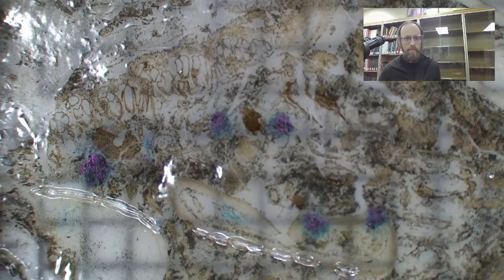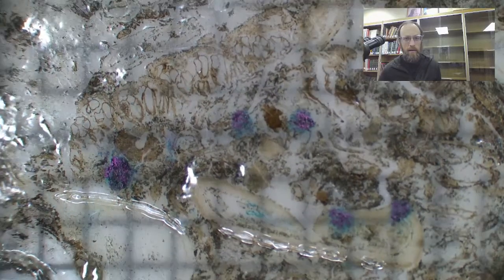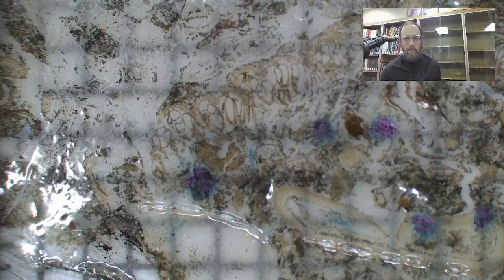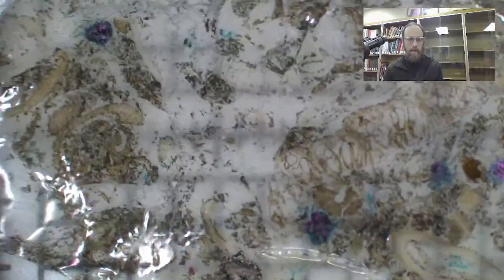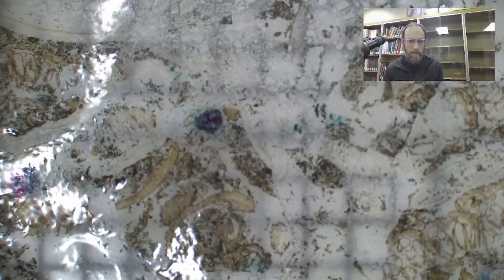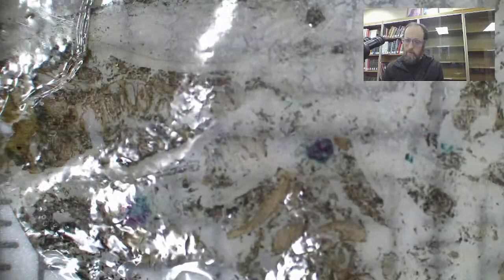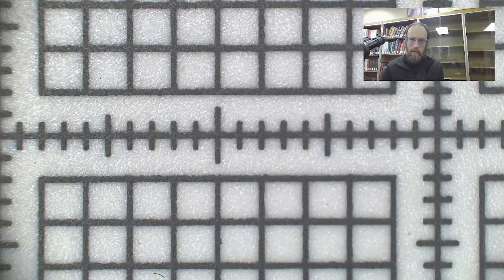As you can see, there are some marks on it. Some of these have been made by my advisor, Dr. Ann Raymond at Texas A&M, and some have been made by me as well, as I've been looking for coprolites. So I'm going to turn it to the non-glossy side. It's a little easier to look at.